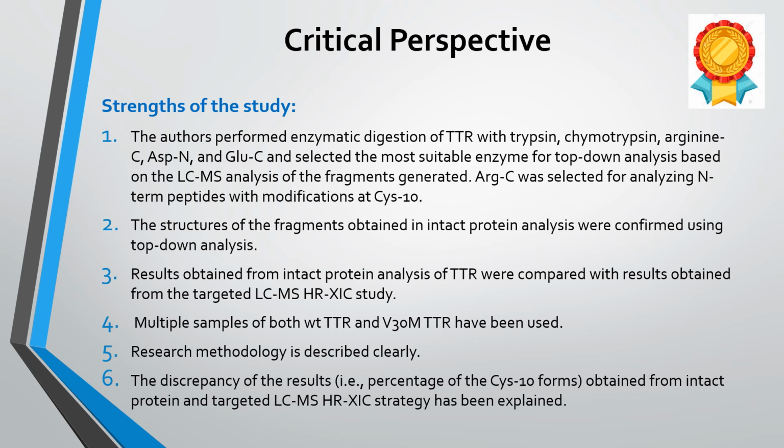According to the authors, intact protein analysis is capable of providing relative quantities of post-translational modifications present, whereas the targeted LCMS high-resolution extracted ion approach is a quantitative method with higher sensitivity.